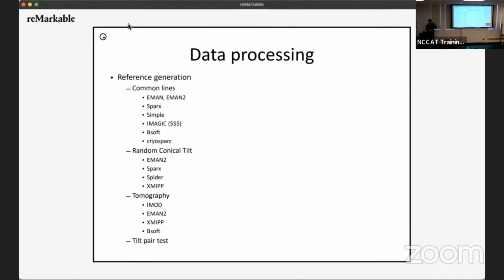By only keeping the class that was the shiniest, where you could see definite 2D structural elements, suddenly he went to 3.5 angstrom resolution. Basically the blurriness was not easy to sort out in 3D in his case, or maybe he didn't find the right parameters in 3D classification to get rid of all those particles that were true membrane protein, just more fuzzy.